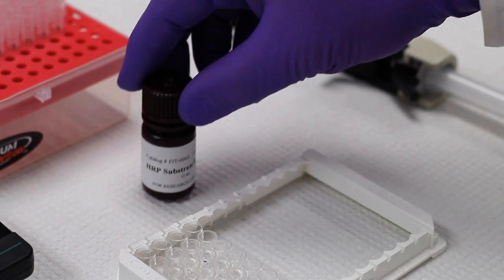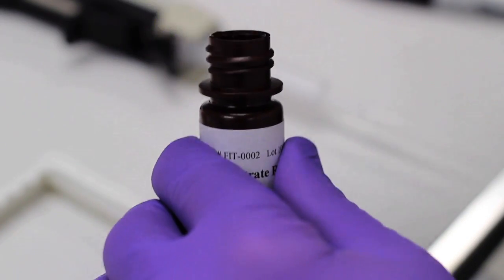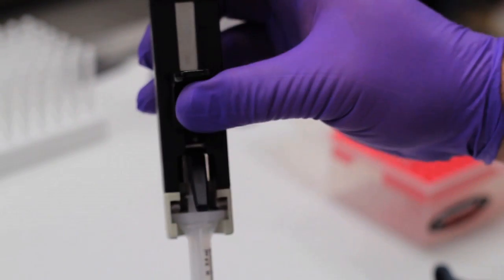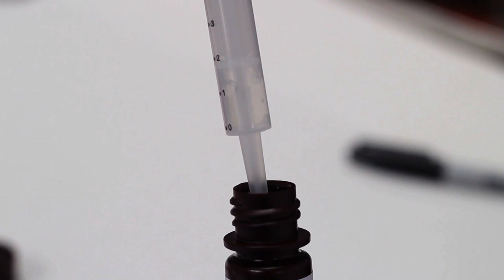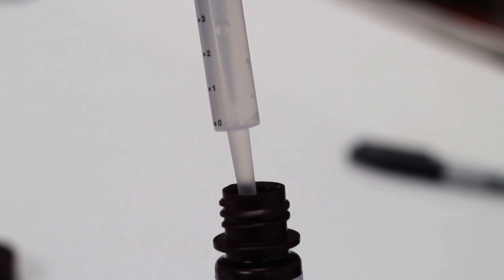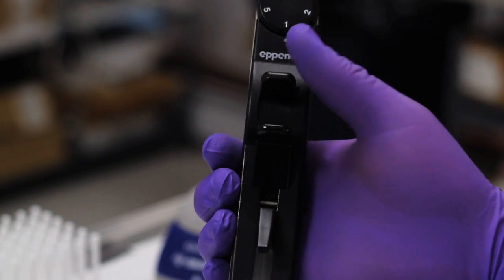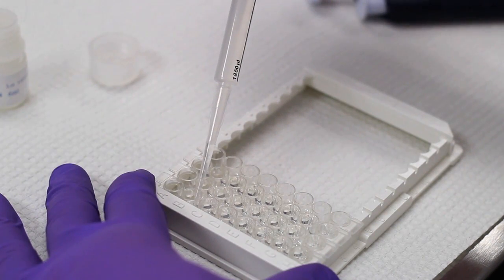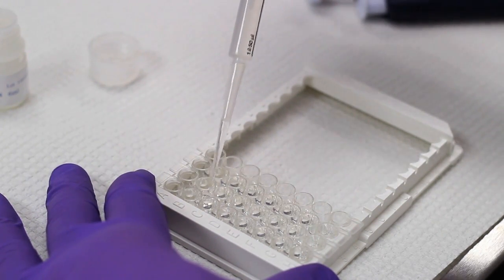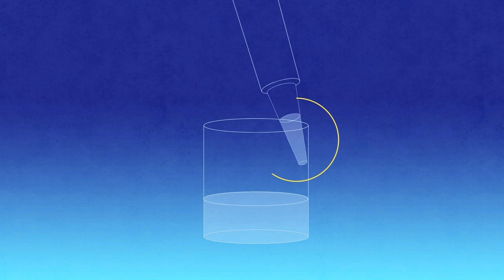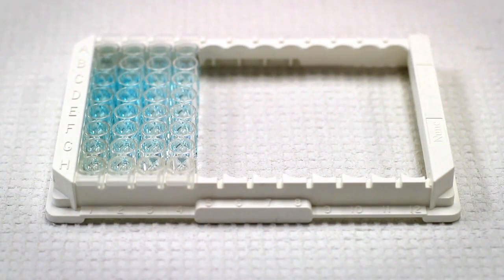Now it is time to add the HRP substrate reagent. Inspect the reagent to be sure it is colorless. If the solution is dark blue, the reagent is contaminated and will not work. Using a calibrated single channel repeating pipette, add 100 microliters of HRP substrate reagent to each well, making sure to place the tip at the top of each well. After adding the reagent, allow the plate to incubate without shaking for 30 minutes.